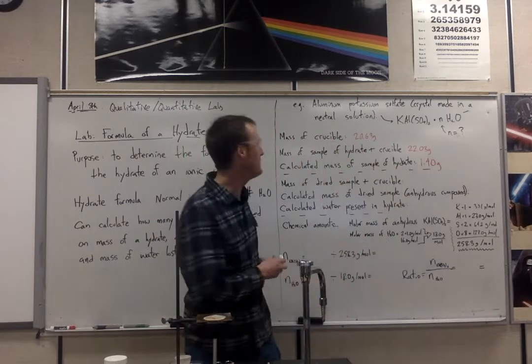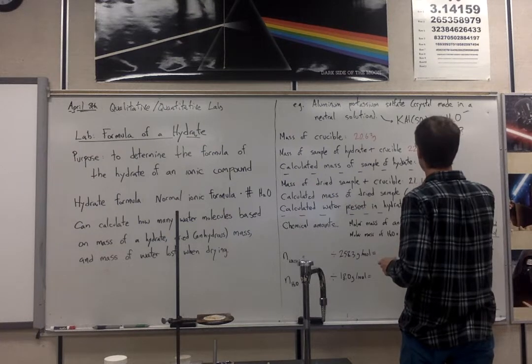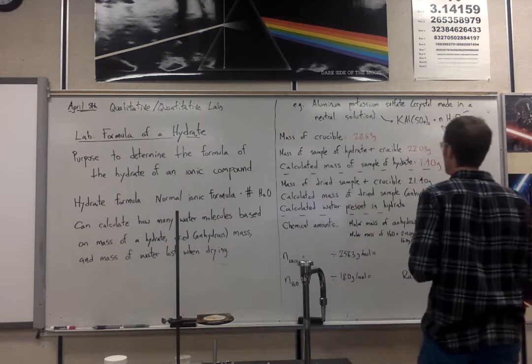And that's all we need. The mass of the dried sample plus crucible is 21.40 grams.